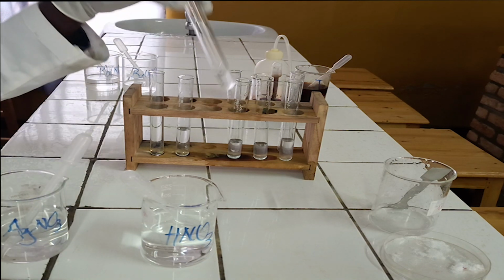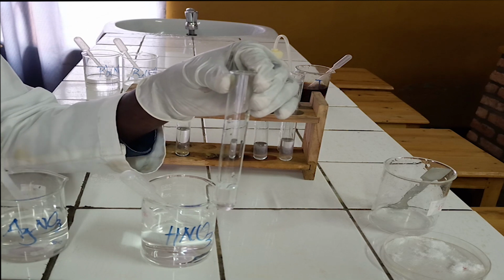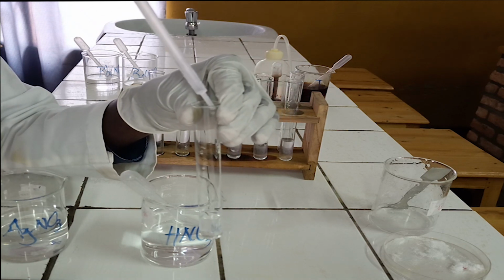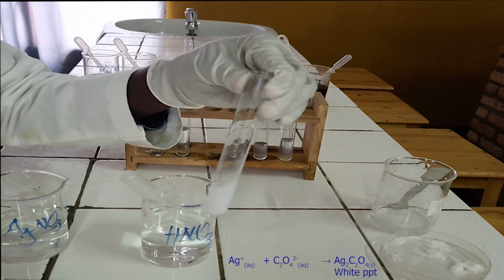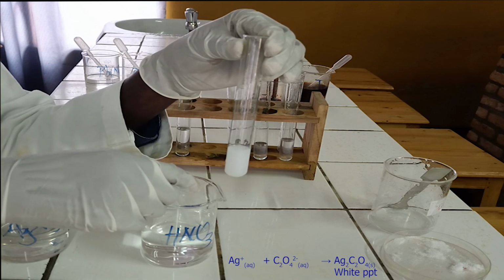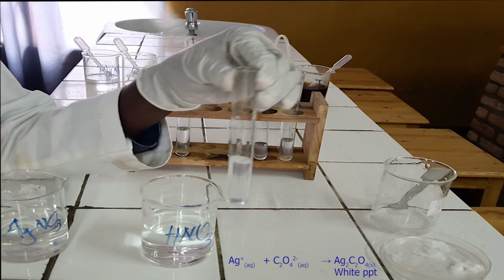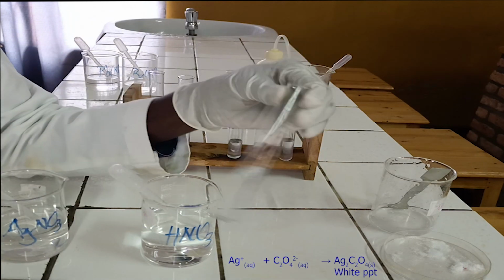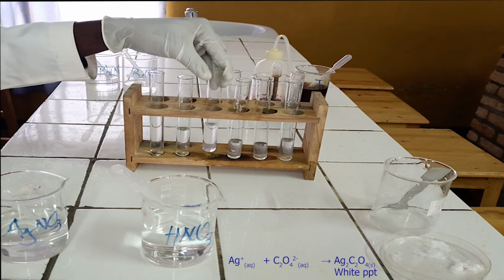To the third test tube, add silver nitrate solution followed by diluted nitric acid. As you see, silver nitrate solution reacts with oxalate ion to form white precipitate. The precipitate formed is soluble in diluted nitric acid without effervescence. Below, there is the ionic equation for this reaction.